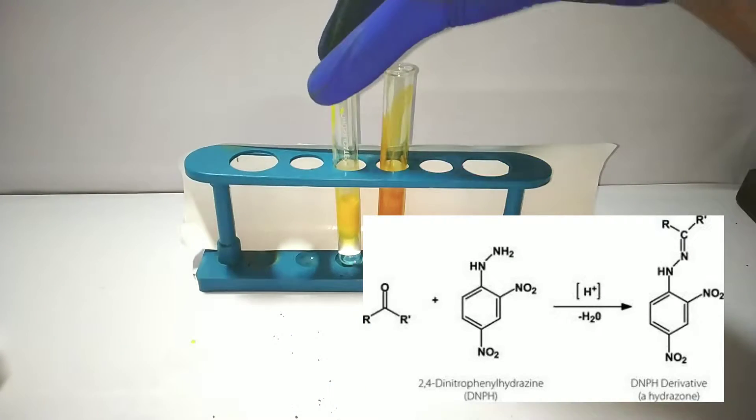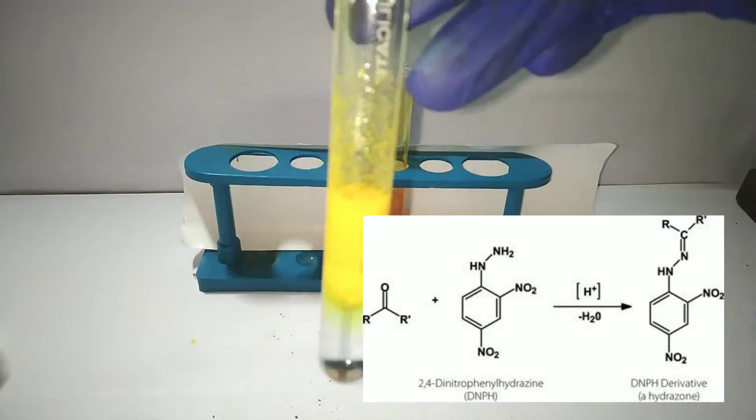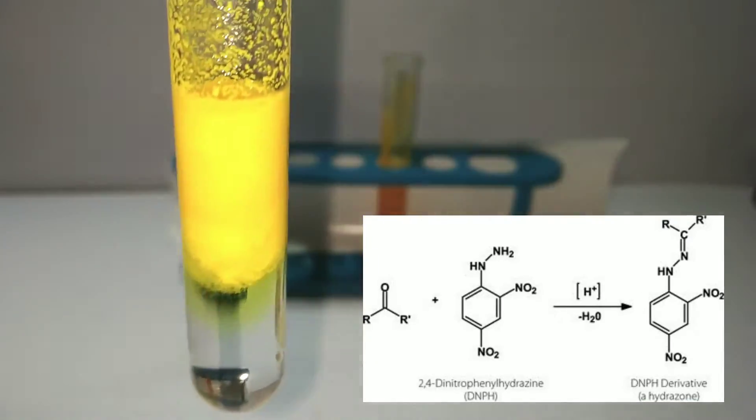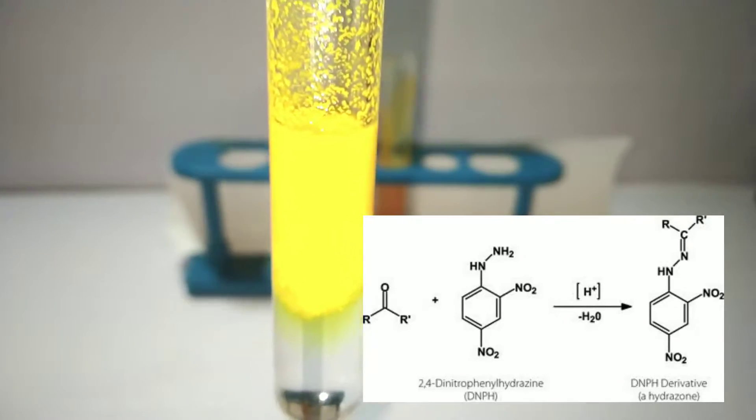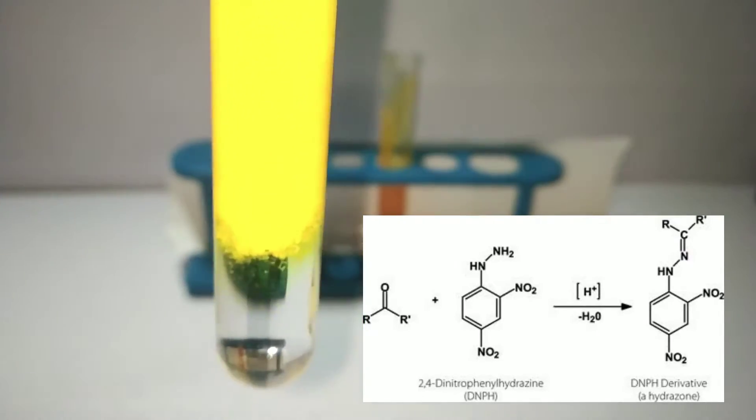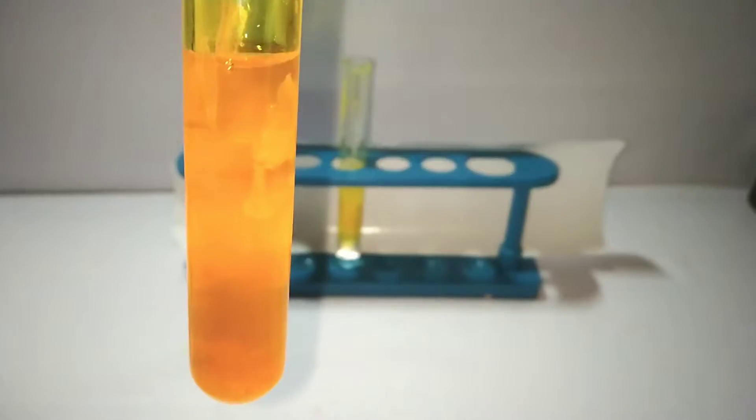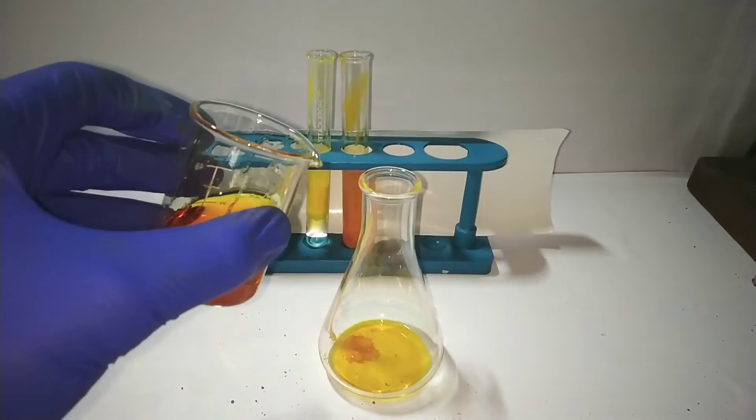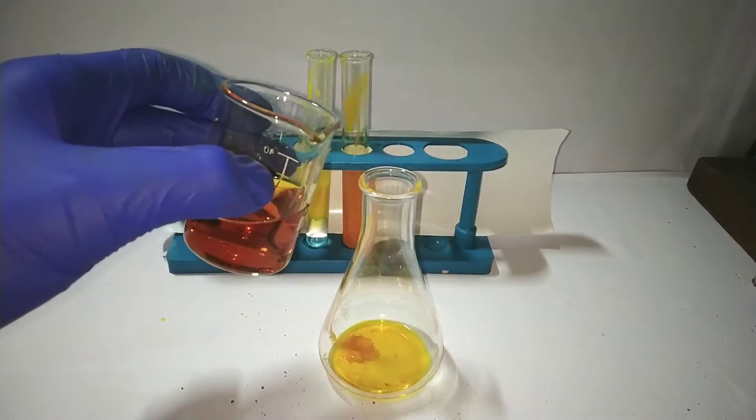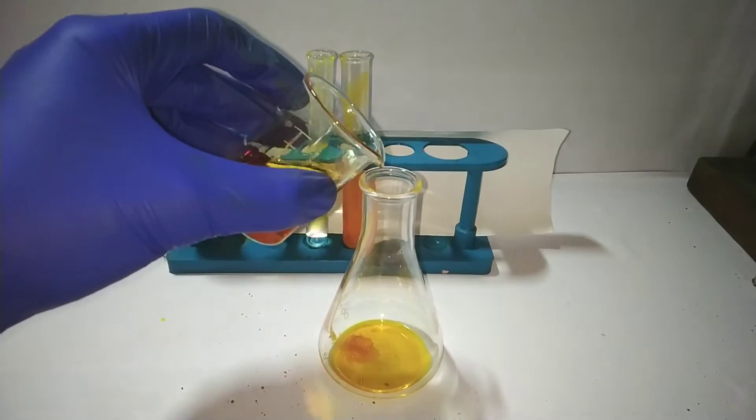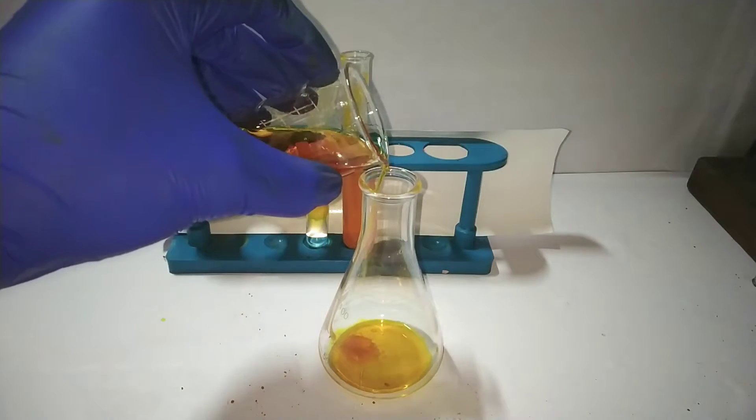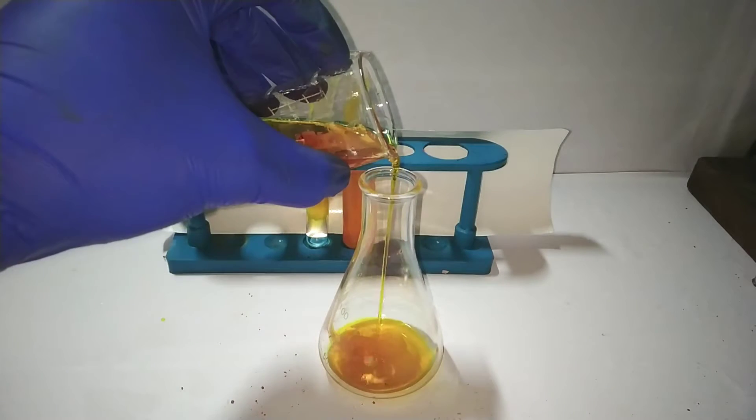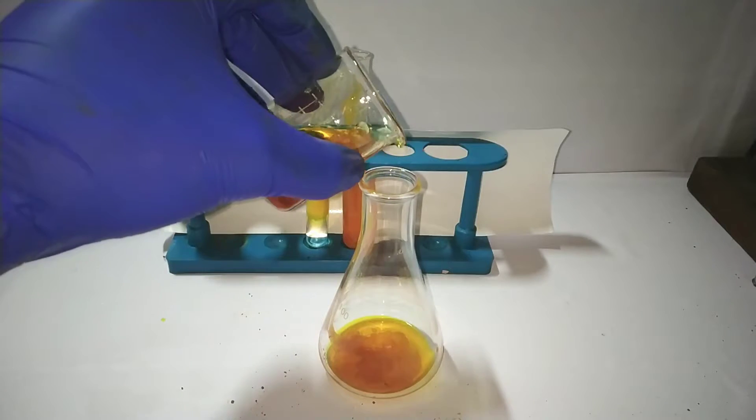Orange precipitate is obtained from carbonyl compounds in which the C double bond O group is conjugated with a C double bond C. This test is also called Brady's test, and the Brady's reagent is the 2,4-DNP solution made by dissolving the solid in concentrated sulfuric acid and adding ethanol. So what happened here is 2,4-dinitrophenylhydrazine is getting converted to dinitrophenylhydrazone. As the precipitate looked beautiful, I decided to make more of it by adding the reagent to aldehyde and ketone solutions in the conical flask.